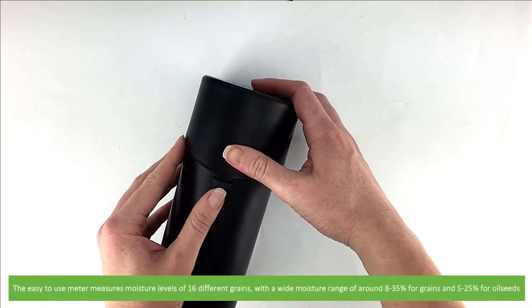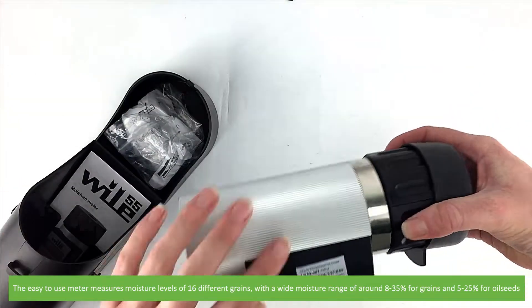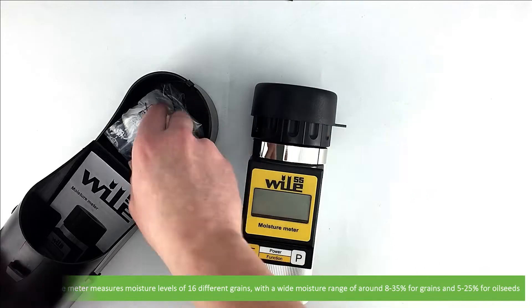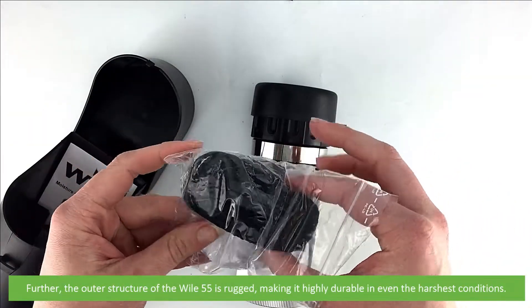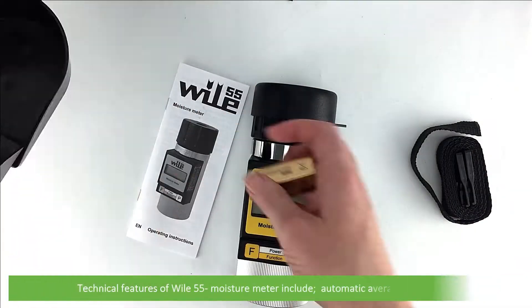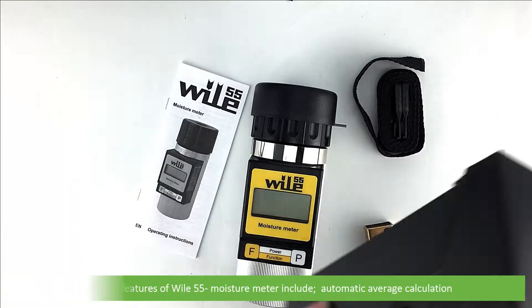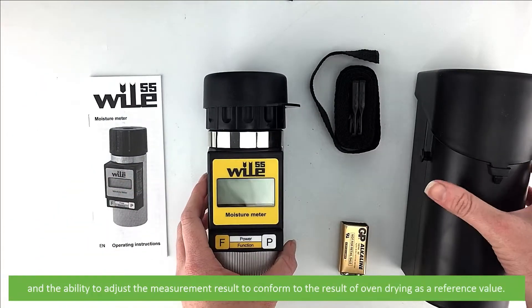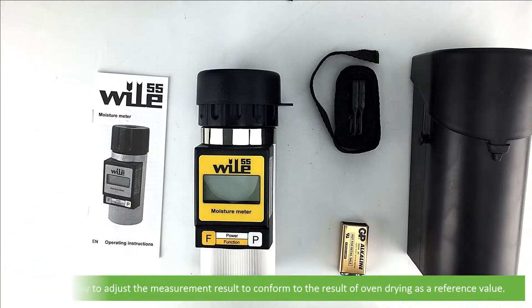The easy to use meter measures moisture levels in 16 different grains with a wide moisture range of around 8 to 35 percent for grains and 5 to 25 percent for oil seeds. The outer structure of the Wiley 55 is rugged, making it highly durable even in the harshest of conditions. Technical features include automatic average calculation and the opportunity to adjust measurement results to conform to the result of oven drying as a reference value.